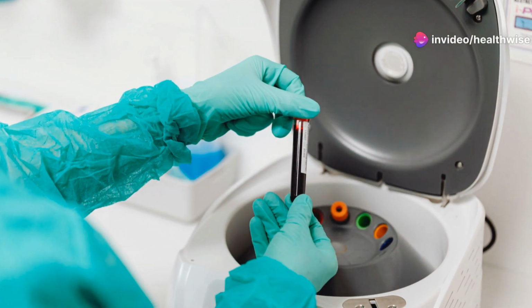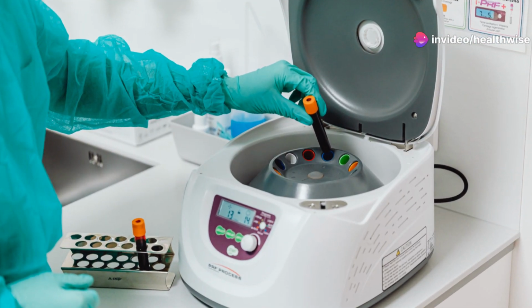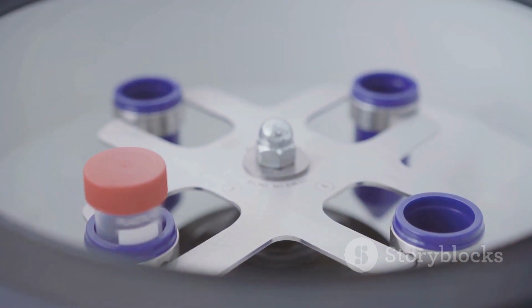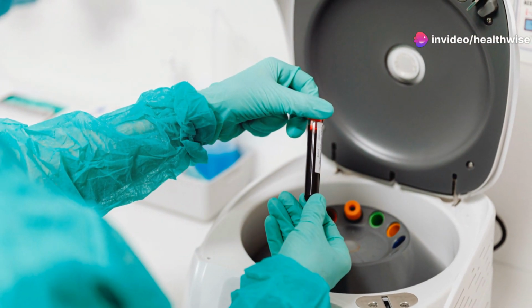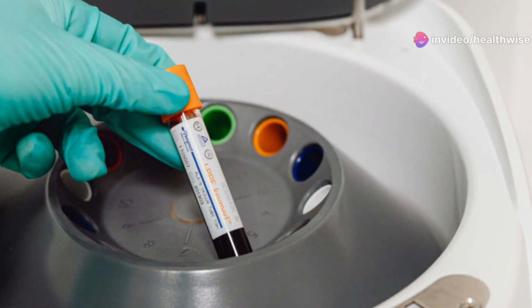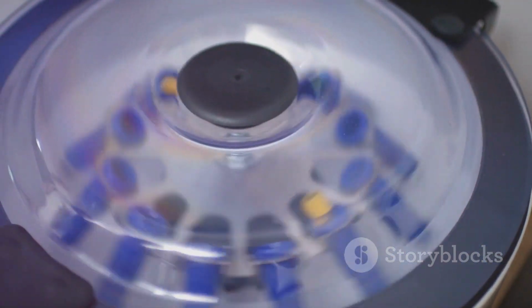Section 6. Keeping the spin going, centrifuge maintenance. Like any piece of laboratory equipment, centrifuges need regular maintenance to ensure they continue to operate safely and effectively. Here are a few simple maintenance tips. Cleanliness is key. Regularly clean the rotor, lid, and interior of the centrifuge with a mild detergent and disinfectant. This helps prevent contamination and keeps your centrifuge looking its best.